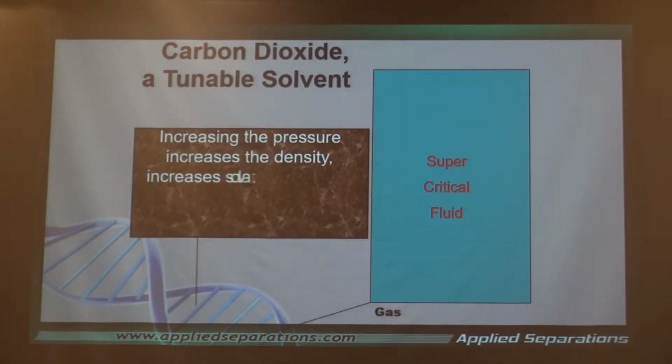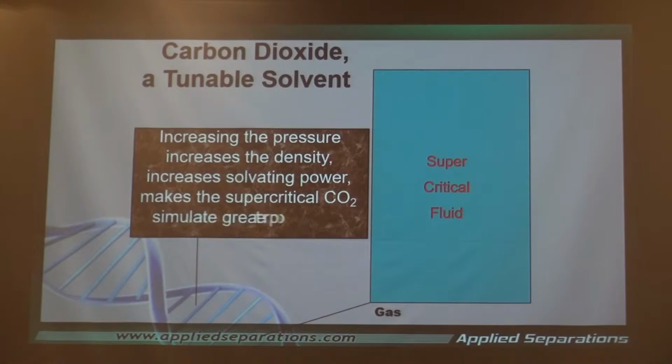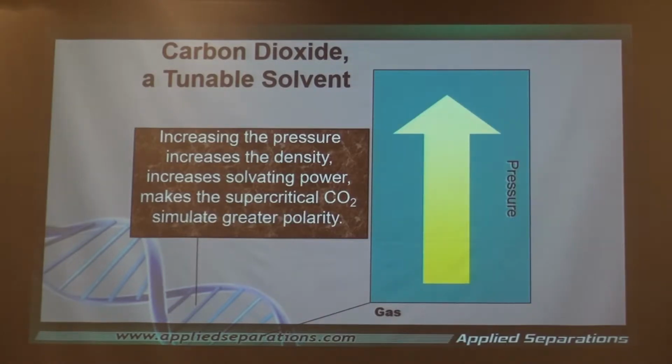In that supercritical fluid area, by increasing the pressure, we increase the density, thereby increasing solvating power, and we kind of simulate greater polarity. So we can go from a nonpolar kind of condition all the way to a more and more polar. Now, I don't mean to say at all that you're going to make CO2 behave like methanol. That is not the case. I just merely put this in as a relative scale to show you that as you increase the density, you increase the solvating power.